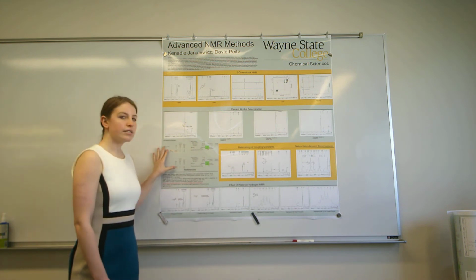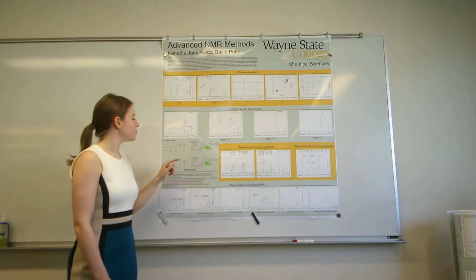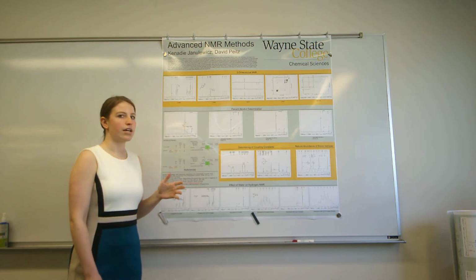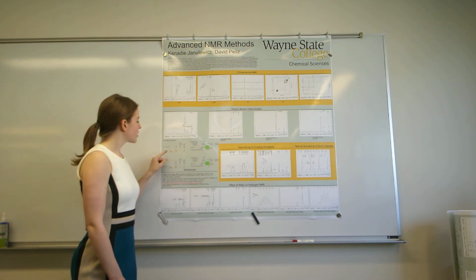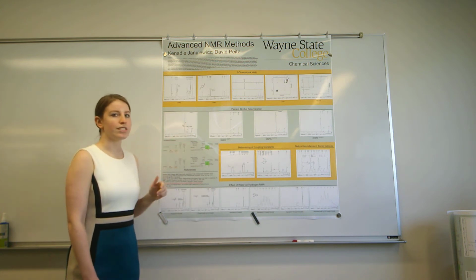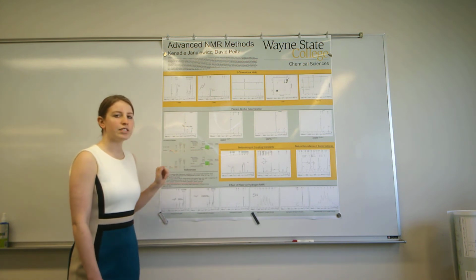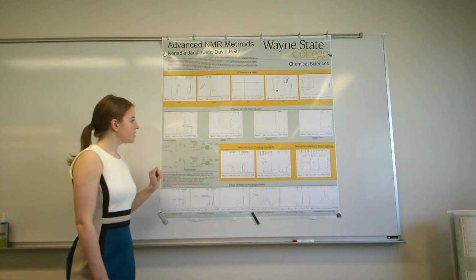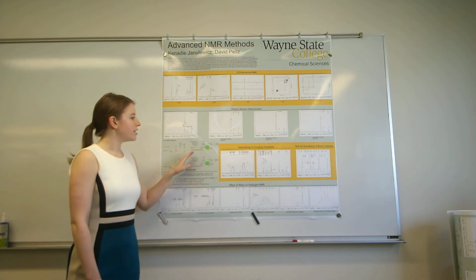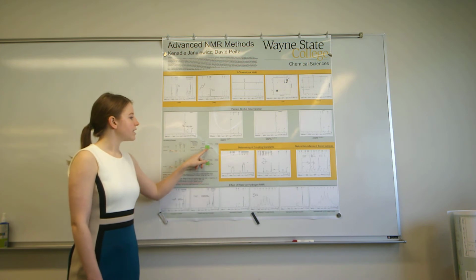We came up with an Excel spreadsheet to help us with calculations, where we will use the areas of integration, which are highlighted in pink, to calculate our mass of alcohol. We arbitrarily assigned our alcohol and water peak to 1,000 to display more significant figures. Here we can see our CH2 peak came out to be 171 and 256 for the CH3. Using the molar mass and density of water and ethanol, we are able to calculate our percent by mass.